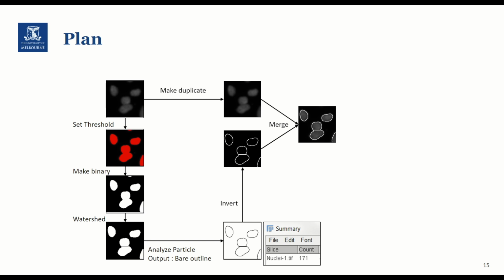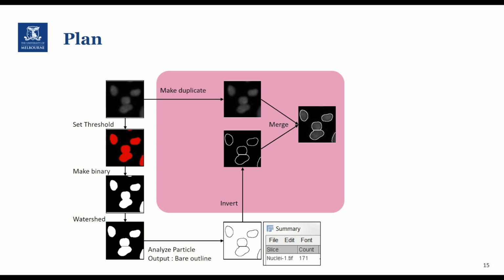You may think that the measurements are already there, so wondering why we need this step. Making a proof image is a very important thing to consider when we are planning a batch process. When processing many images in batch, we never know if our workflow that is set based on only a few images is going to be good enough. So making a proof image where we can compare the original data and our segmentation result is important in checking if my workflow is reliable.